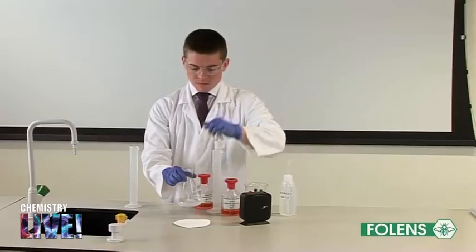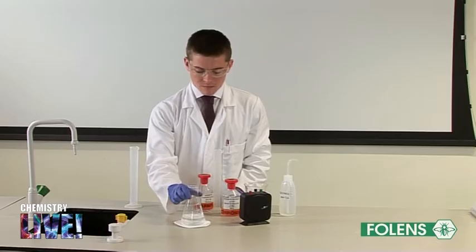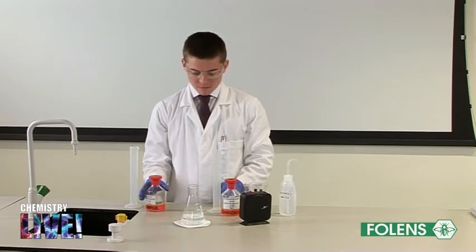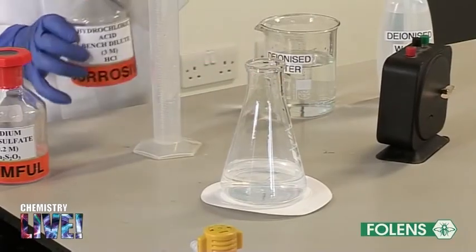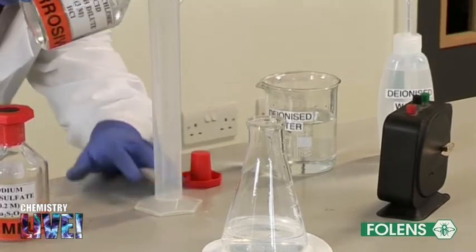Swirl the conical flask and place it on the cross as in step 1. Add 10 cm3 of the dilute hydrochloric acid as in step 1.